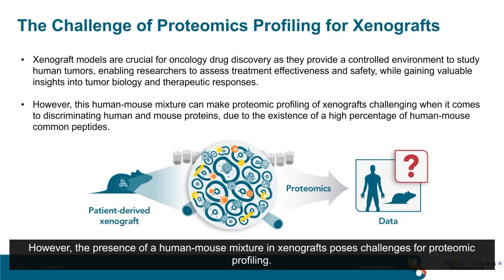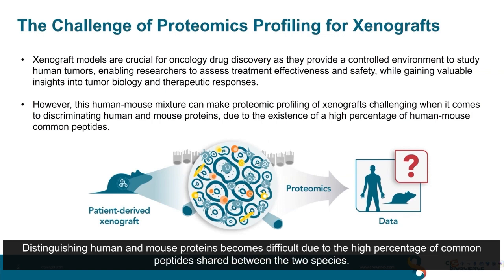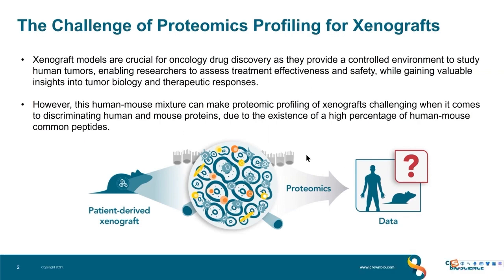However, the presence of a human-mouse mixture in xenografts poses challenges for proteomics profiling. Distinguishing human and mouse proteins becomes difficult due to the high percentage of common peptides shared between those two species.